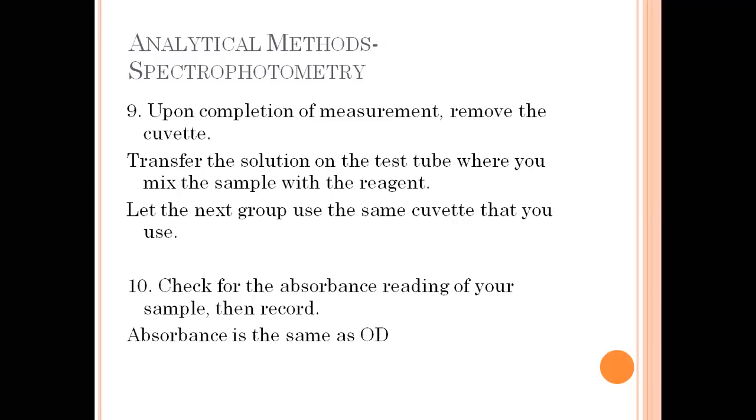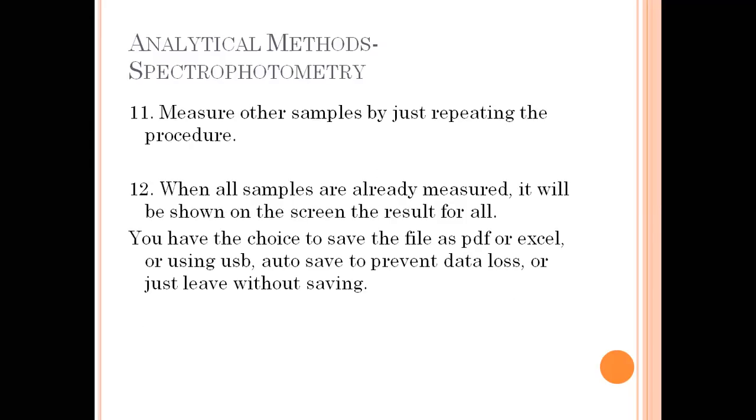Okay? And then check the absorbance reading of your sample and then record. And then absorbance again is the same as OD. So later I'll show you what the absorbance reading of your sample will look like. However, that is already shown to you in the video presented or uploaded on our Moodle.